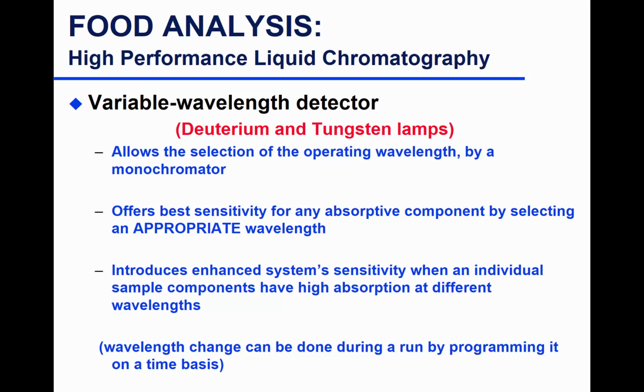So how it works, basically, is you have your flow cell where your sample gets in, and then here you will have your lamp. Ignore my drawing, I don't draw very well, but you have a lamp, and then it gives light. That light is composed of so many different wavelengths. It's not a single wavelength light.